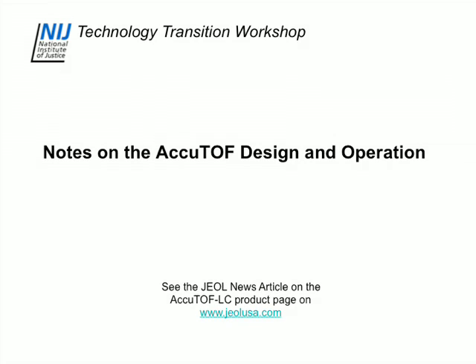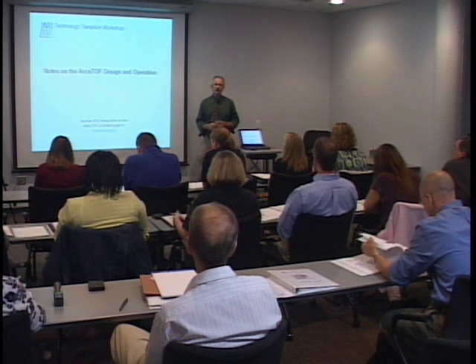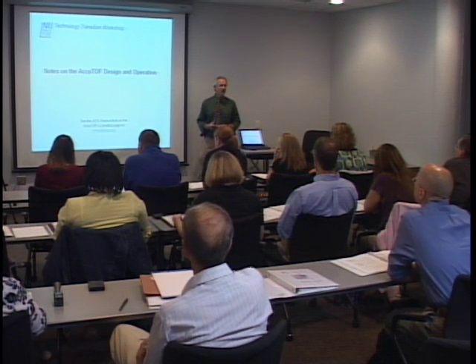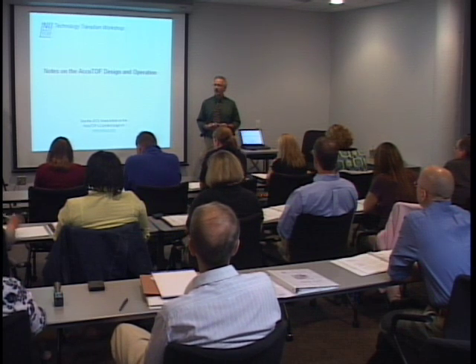Okay, we'll talk about more complex spectra in a little bit, but let's explain how the time of flight works so you can get that out of the way and move on to the fun stuff. Once again, there's a JEOL News article on this, and it's a really nice, definitive article. It's not an advertising article. It tells you in great, gory detail how they chose the different components for the time of flight and how each part of it works.